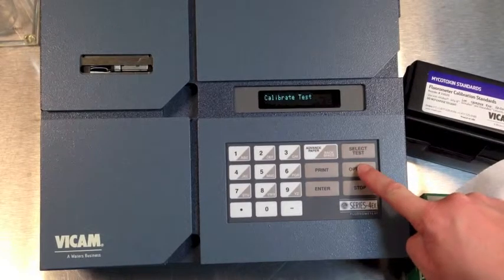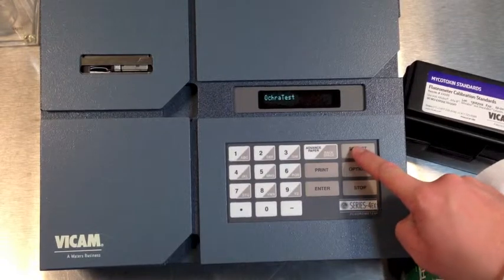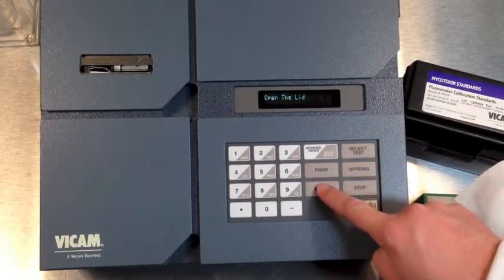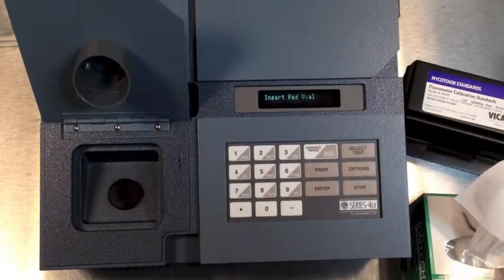Turn on your fluorometer and press Options. Press Enter to select Calibrate Test. Press Select Test to choose okra test, then press Enter. The machine prompts to insert the red vial.